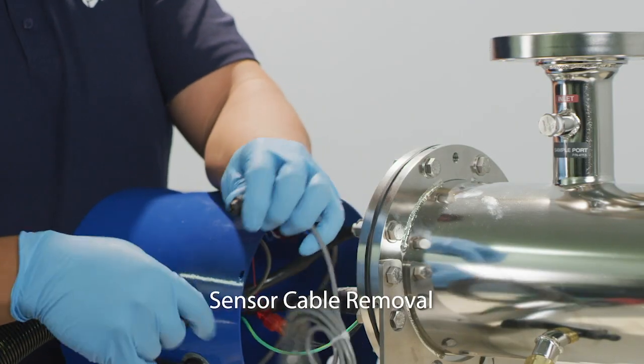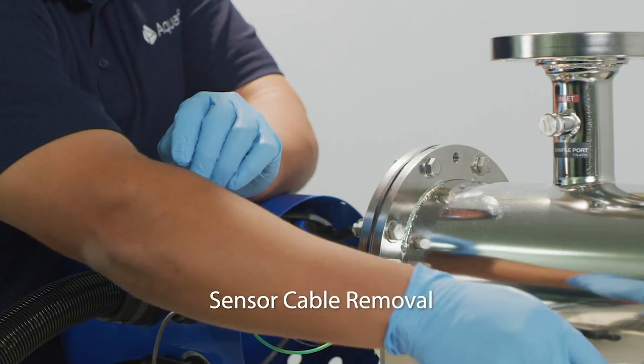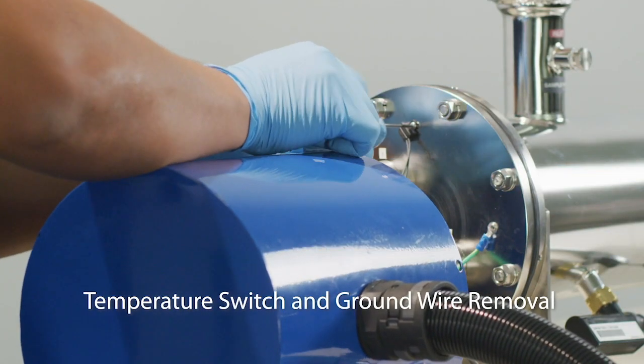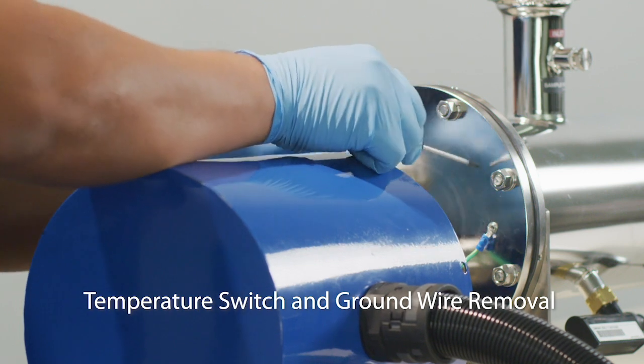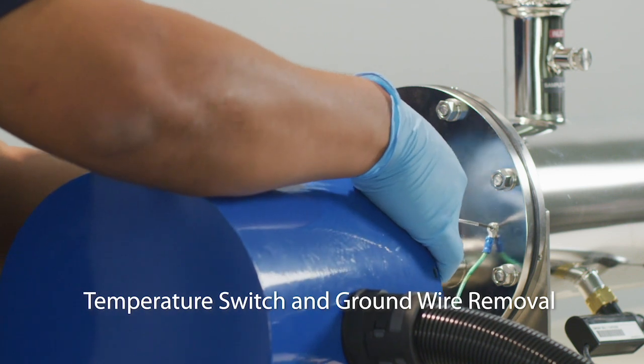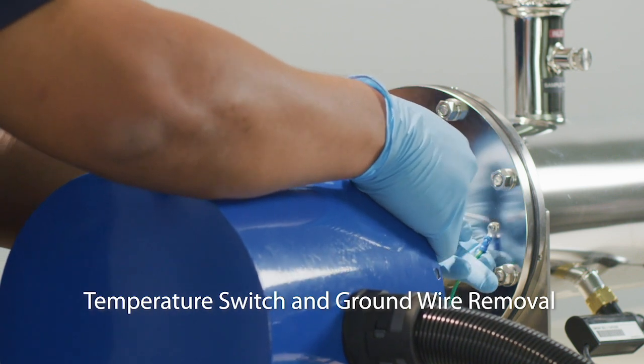Unscrew the black plastic disconnect to remove the unit's sensor cable. Using a small handheld screwdriver, take out the screw securing the surface mount temperature switch located on the unit's end plate. The same process can be followed to also remove the ground wire.